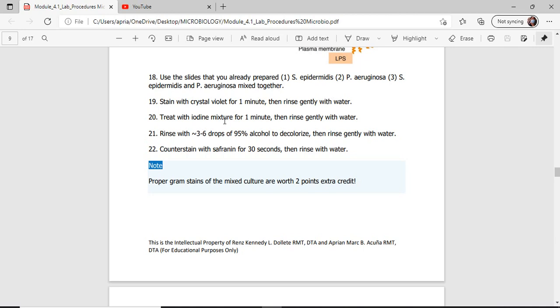In our laboratory, it is Gram's iodine, again for 1 minute. Let it soak in our dye for 1 minute. You leave it. Then rinse with water again. After you rinse it, you need to decolorize it with alcohol. Decolorizing alcohol. Then wash it with water again.